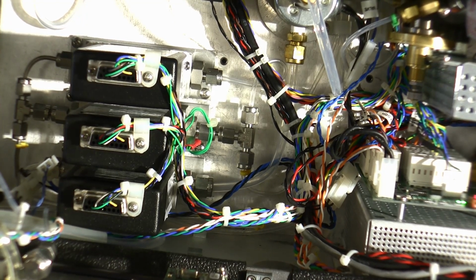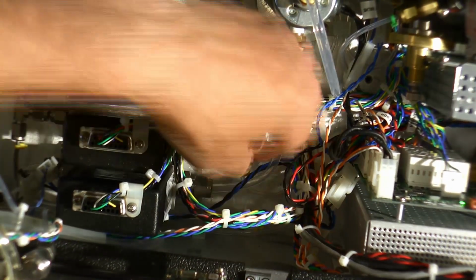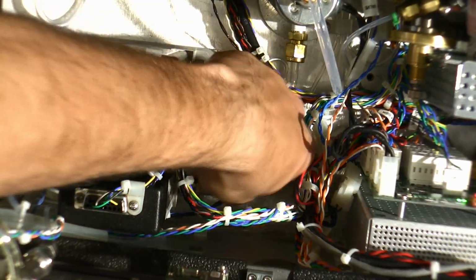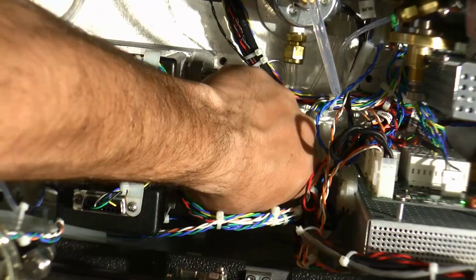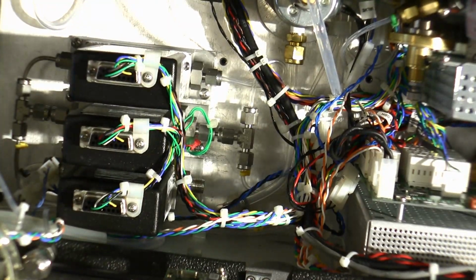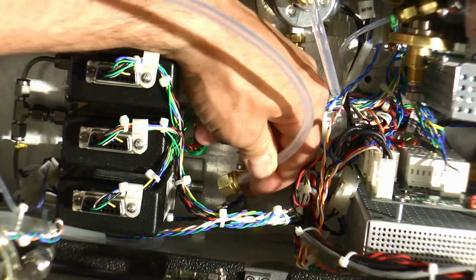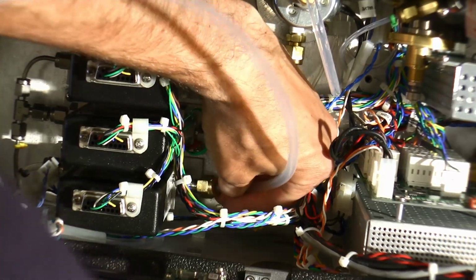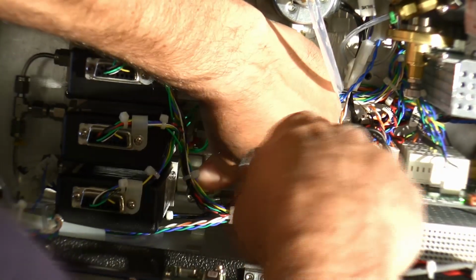When we go ahead and start doing our calibration, what we'll do, if we can see in here, I'm going to come in. The air, you can always tell on this one, is going to have a 1/4 inch Swagelok fitting in there. We'll spin that out of the way and just push it to the side. Now we're going to grab our tube that's going to our flow transfer standard, and we're going to route it in here. It's a little tight, but it's manageable.